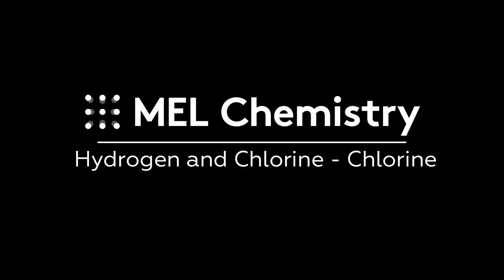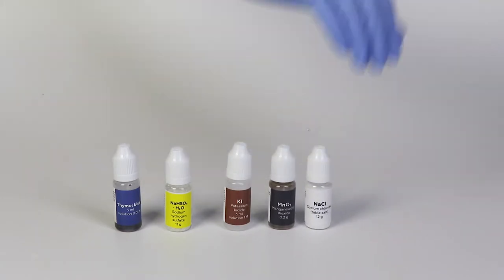For the chlorine experiment, you'll need Thymol Blue Solution, Sodium Hydrogen Sulfate, Potassium Iodide Solution, Manganese Dioxide and Sodium Chloride.